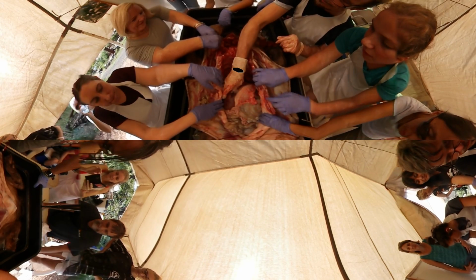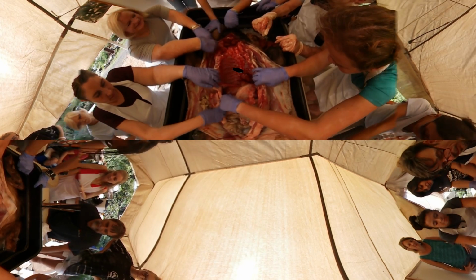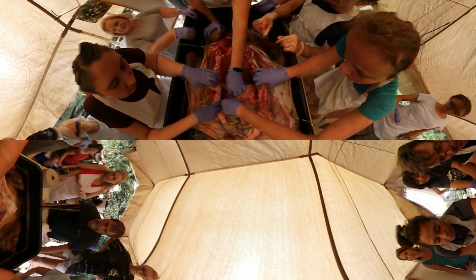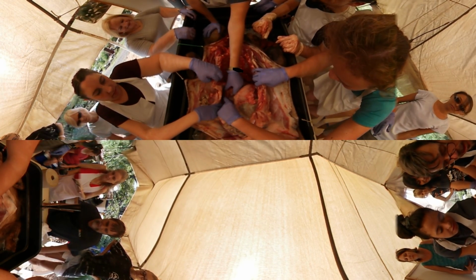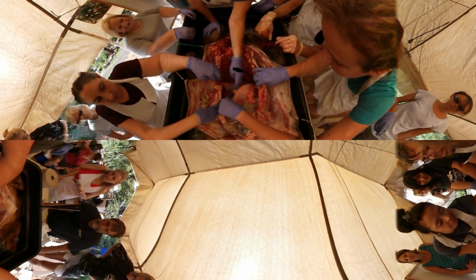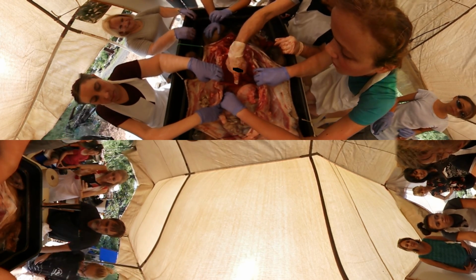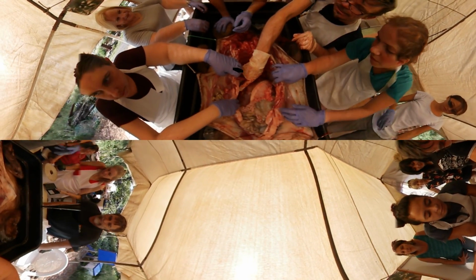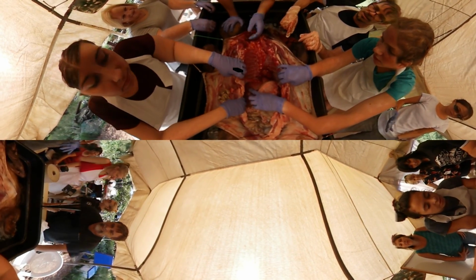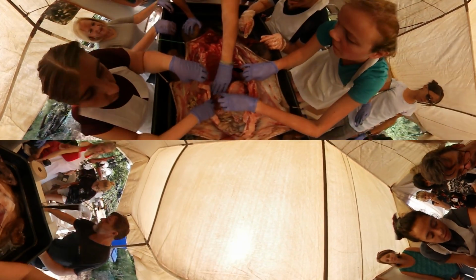This is the liver here. The liver has a number of lobes. Touch the liver. Is this the bottom part of it? Yeah, the liver's a big organ. So it's two parts? Even each lobe is a little bit split. I don't know if in a pig, because this looks like it's got separate lobes, but there are usually two lobes. Now this is interesting because there are some little bumps in the liver. What's this? Can you see that? That's the liver as well. Do you notice there are little white bumps right there, and there? If you feel them, what do they feel like?